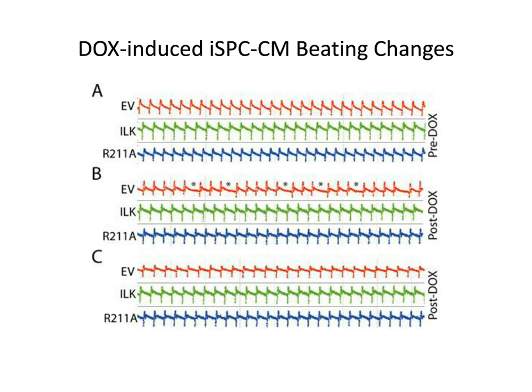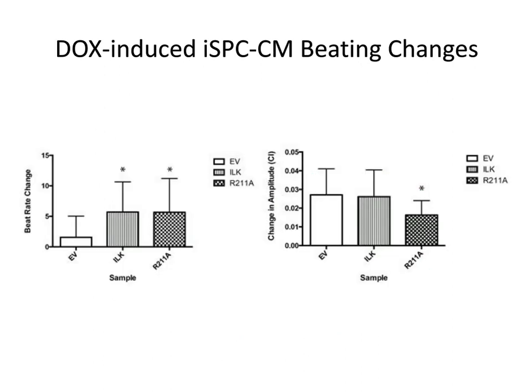So we've corrected both the cellular phenotype of calcium that's induced by doxorubicin and other dilated cardiomyopathies, but we've also corrected the arrhythmias and the contractility that happens as a result of that. So two different metrics to measure the effect of the cells. So another thing that doxorubicin does on iPS cardiomyocytes is that it slows the beating rate as a result of reducing this calcium cycling.